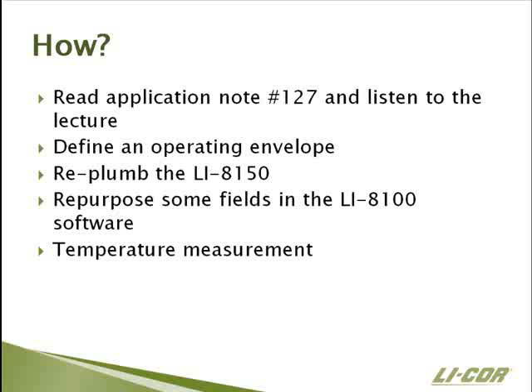The next thing you'd have to do is replumb an 8150. You'd have to install an auxiliary pump. You'd have to interface this with the normally open side of the solenoid manifolds. And then when it actually comes time to make the measurement, there are a lot of fields that make sense for making soil flux measurements with the soil flux chambers that either don't make sense when you're measuring discrete samples or their meaning changes significantly. And so we talk about repurposing some of the software fields in the LI-8100 software. And then the final thing I want to talk about in terms of how you actually do it is how you can get an integrated temperature measurement with the flux measurements.